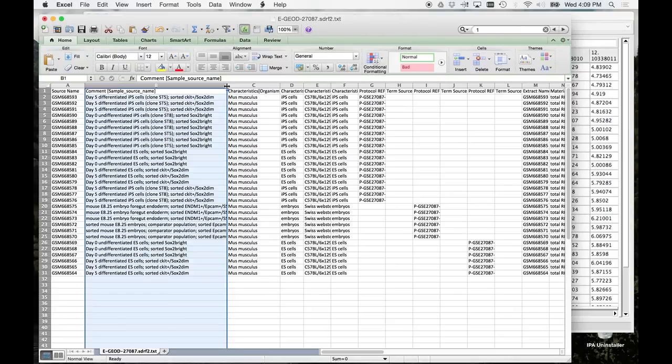This is a good column in that it gives you everything that's in that study, basically in the name. And whenever I name anything, I always put everything I can into the name, which drives people nuts. They're like, Mike, why is your file title 80 characters? And I'm like, because there's a lot of stuff in there. Here's what we want to do: we want to basically take some of this. So if we look here, everything kind of transfers, right? They've got the clones, they've got the characteristics of the cells. Here's the information that we don't have: we don't have days, right?